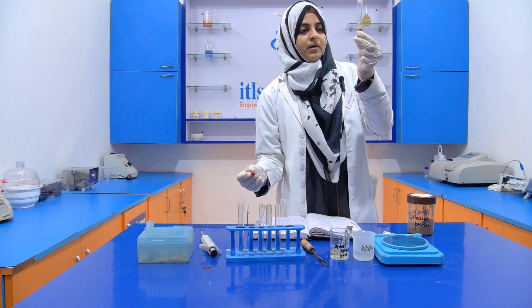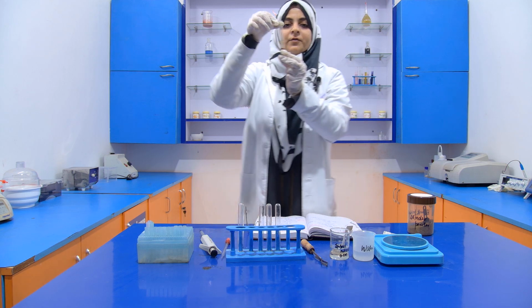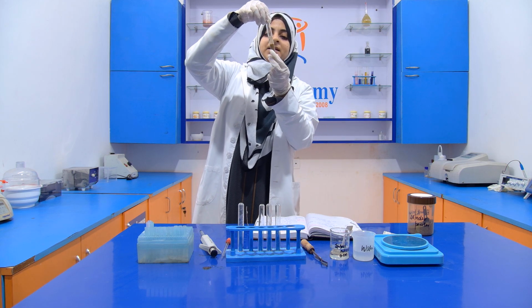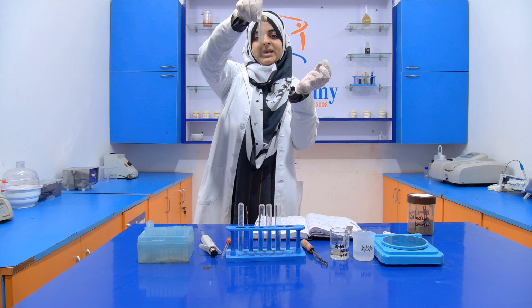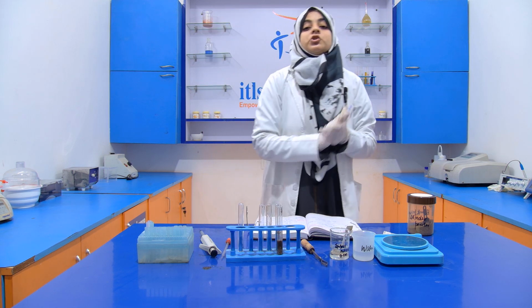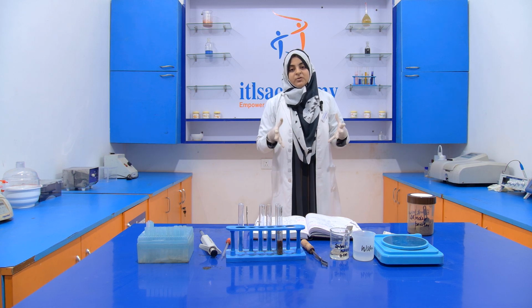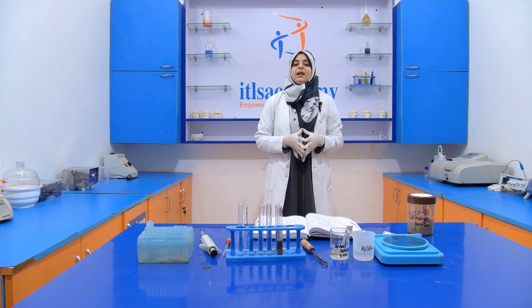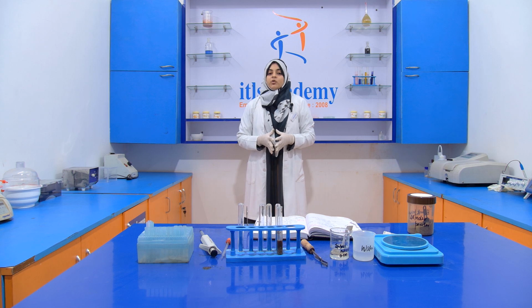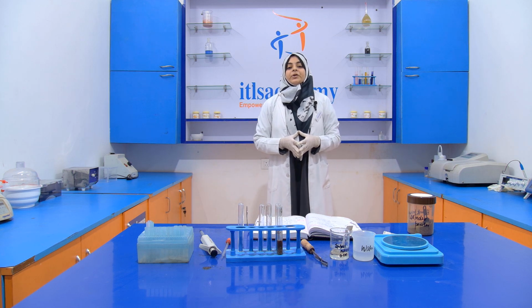If common salt is present, then we get a white precipitate. Here you see that we don't get any white precipitate, which means that our sample does not contain any common salt, which means that our sample is pure. So this is all about the detection of common salt in coriander powder.